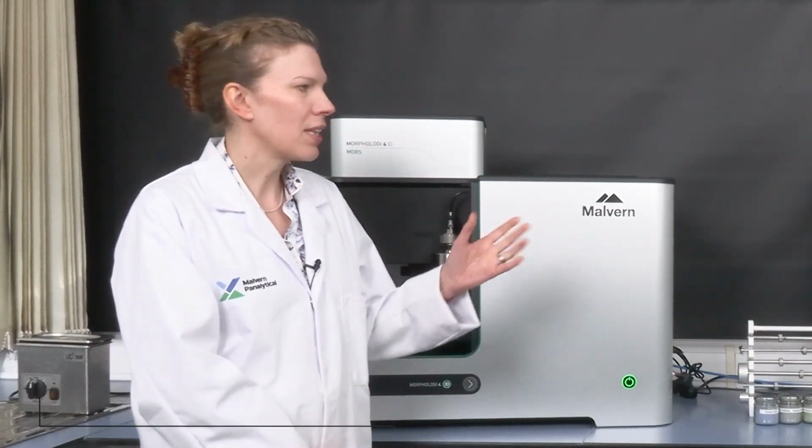So we can look at the bulk powder flow using the FT4, and then we can see on a more size and shape individual particle level using the Morphologi 4. Particle properties and bulk behavior come hand in hand, but before we discuss how the data from each instrument can be combined, let's have a look at how each individual instrument works and what they measure.